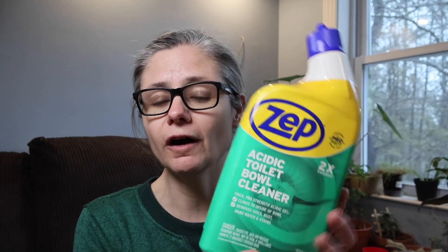Now in reading about Zep, it doesn't say anywhere on this bottle that it is even made to remove bacteria. It really seems to focus on removing soil, rust, and hard water stains. But I'm gonna test and see how well it removes bacteria anyway.